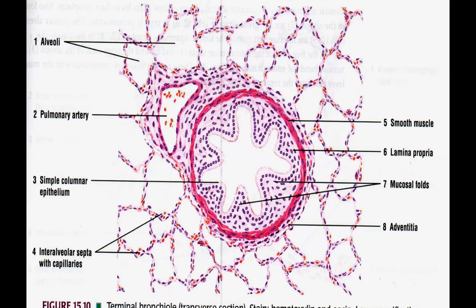So it's just a similar thing that is here. This is the epithelial lining. You can see that it's just a simple epithelium. So what is it? Simple columnar epithelium. When you come to the respiratory bronchiole, you will see that it is non-ciliated. That is one key thing you also have to take note of.